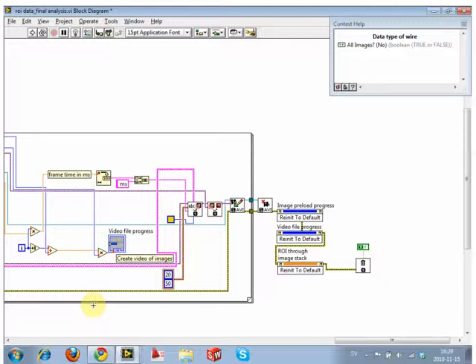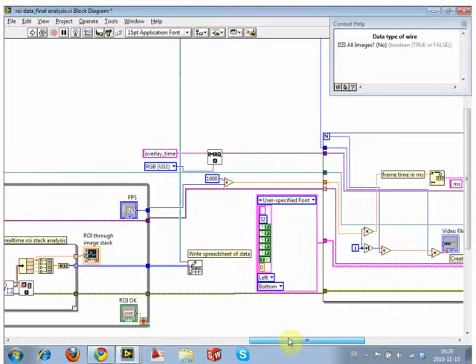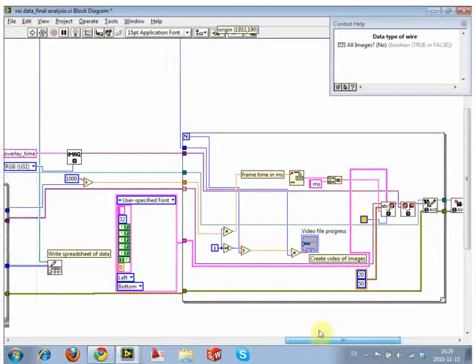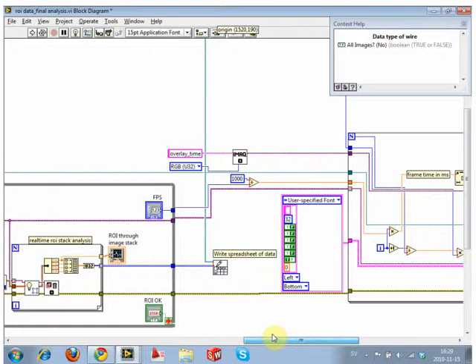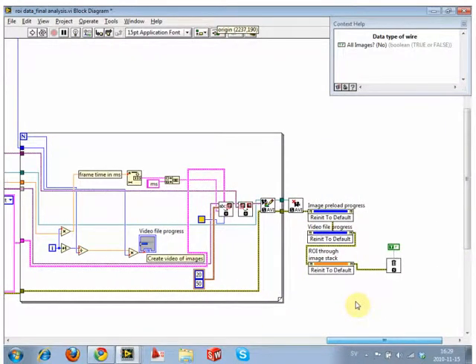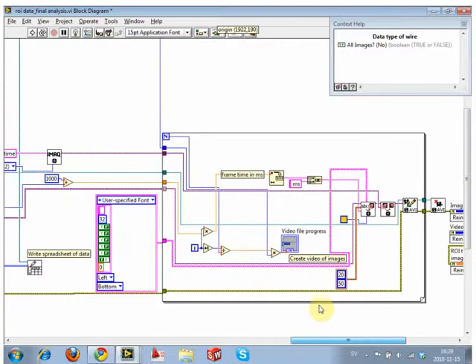It would be nice to have a reinitialize everything to default. I've never seen one, but there might even be one, and if there is, that would be a great button to use. In this program, basically all the images stay until the very end. But you might as well put the rubbish bin on every single image whenever you don't need it anymore. And in the end, you wire this arrow wire from the beginning to the end, so it doesn't have to be there.